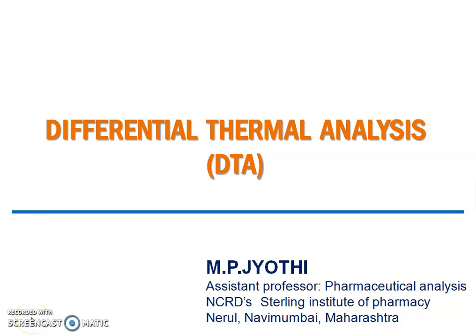Hello and welcome to this short session on differential thermal analysis, also called DTA. In this online video, I'll be discussing the basic principle involved in the DTA process.